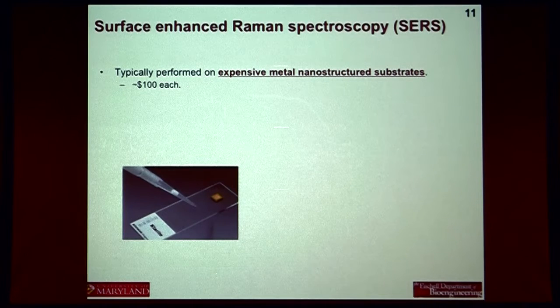Right. This has those exact same limitations. So depending on how you need to interface that environmental aspect with your sensor, all the time that that takes based on how you've engineered your system is ultimately the limiting factor. And we'll even consider what our paper system does to that aspect of it. So once the analyte is on the nanoparticle, it's instant. But getting the analyte to the nanoparticle is the challenge.